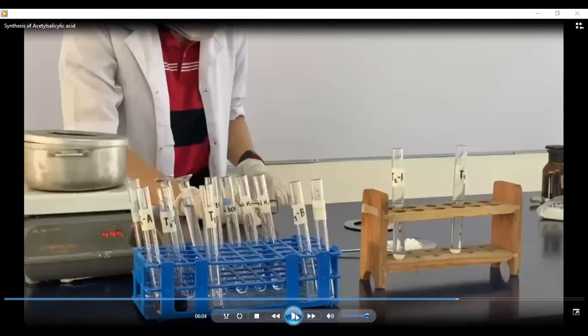Similar to earlier, we had to make a solution first, so just water, distilled water. Then we added our aspirin. The one on the left is your lab available, and the one on the right is the one we synthesized earlier.